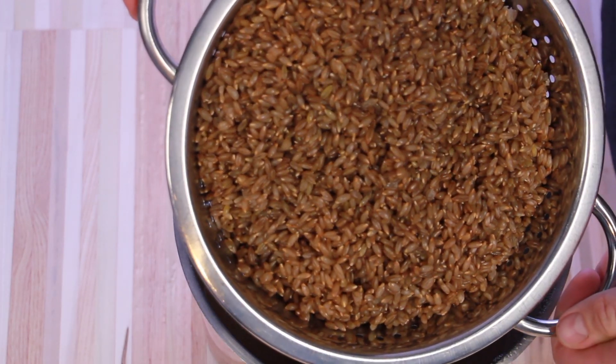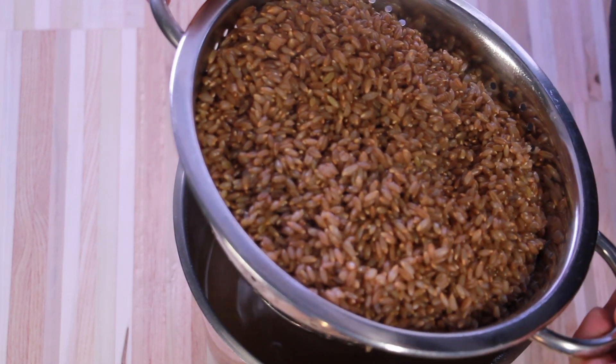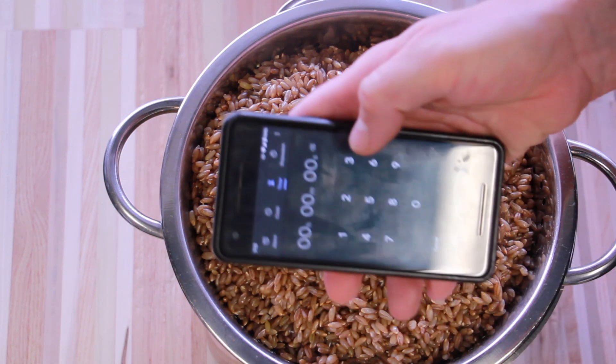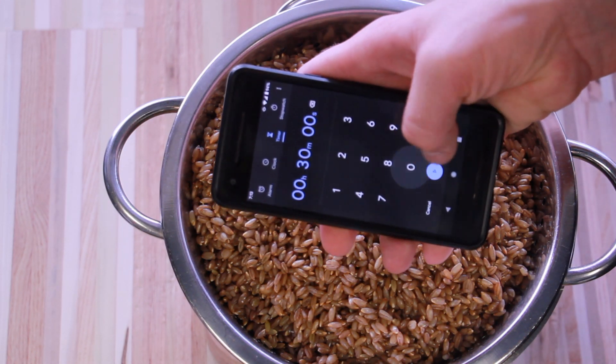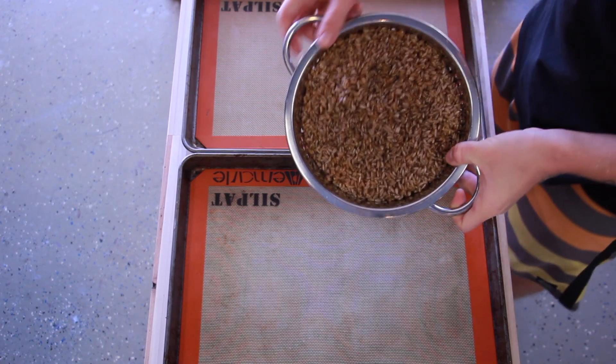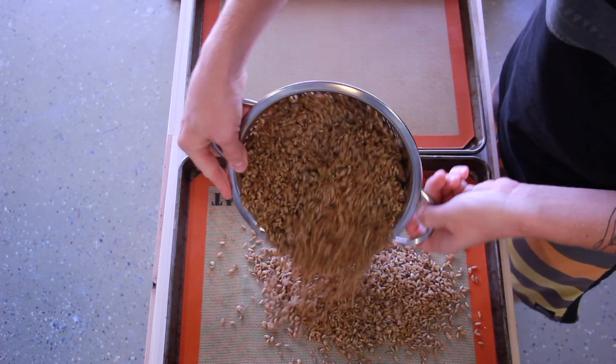Give it a good shake to try to get most of the water out, and then just let it sit for about 30 minutes.